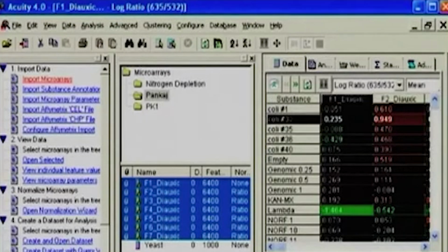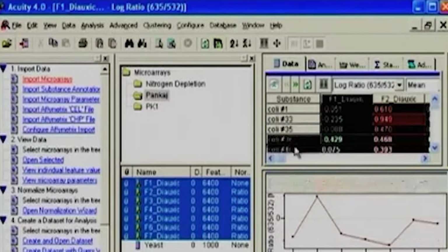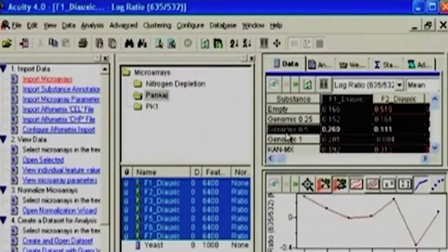So in the down, if I just click on the profile button, based on what I have selected, I can look at the different profiles, how it has behaved. So in this fashion, immediately I know my parameter file, what each one is, and I see that okay, this is all normal averaged. In one of the cases, it went up. So similarly, different features can be individually analyzed and then checked for how the behavior is. So you can actually look at the trend for the same gene during the whole time course analysis. Correct. So you can also trace a little bit of working on the data.